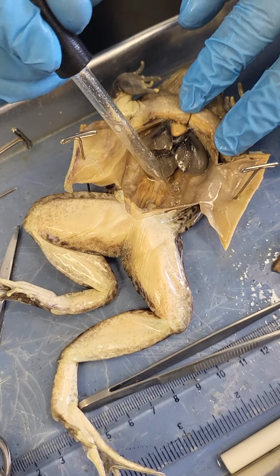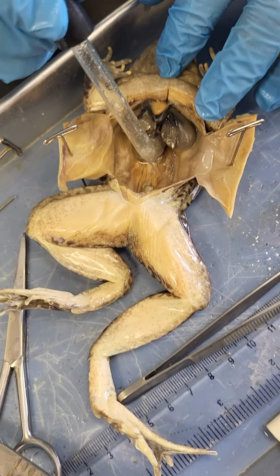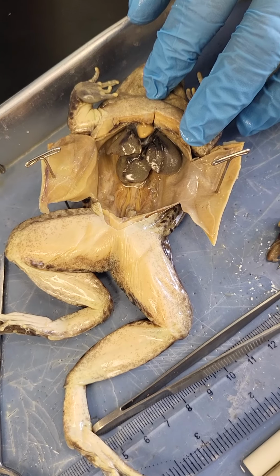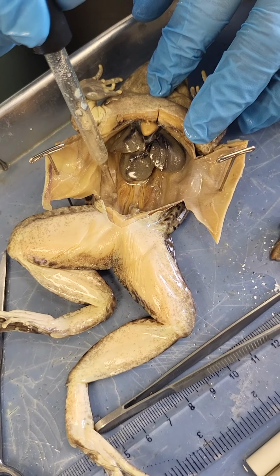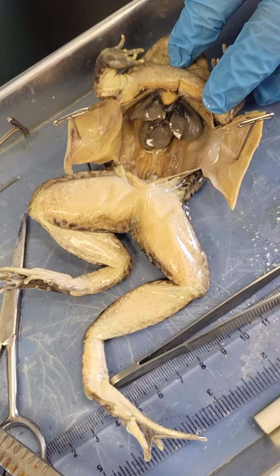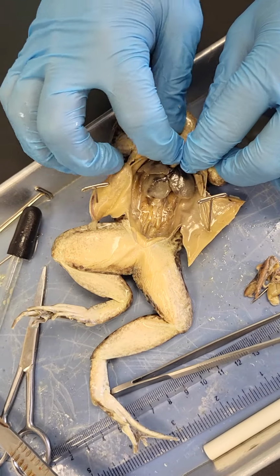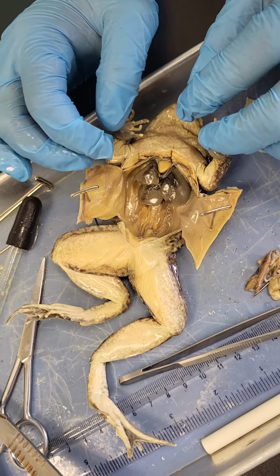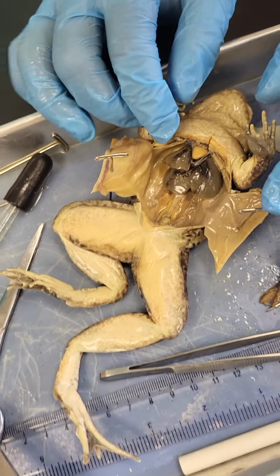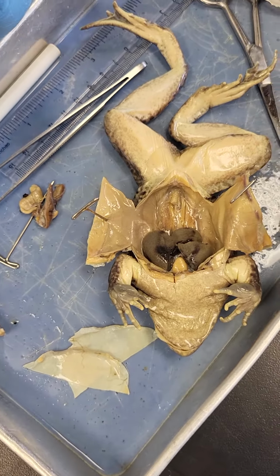Oh my gosh. Okay. What's next? Label the parts of the urogenital system. So this. Oh, I don't know. Wait, no, which one is it? No, this is the whole system. Which is the testes and which is the ovum? I don't know. Okay. I cleared out all the juices. I think this is the testes. Yeah, which one is it? Which one is the male one? No idea. This frog is a guy. I feel bad for you guys. Wait, we're done. Switch. I want to say male, female? That's what I was thinking. Male, female. Yeah. That looks really big, so I'm going to assume that's female.